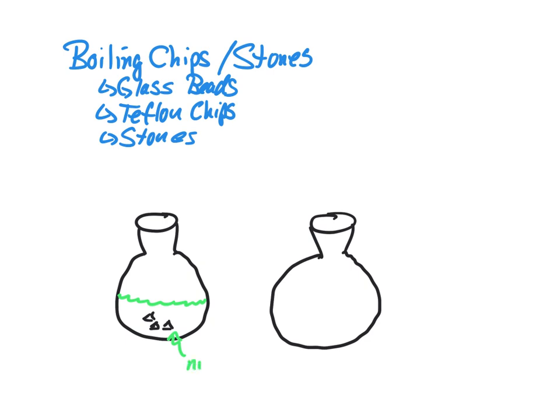These provide a nucleation site which lets bubbles form smoothly.